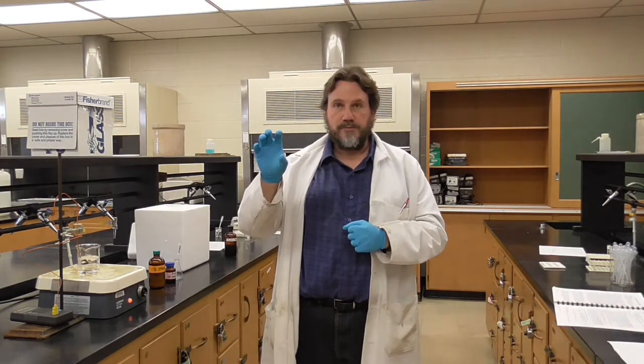The reaction that we're looking at is always the same in this lab. We're taking starch and we're breaking it down. All right, so the hydrolysis, the breakdown of starch. Of course, starch you can find in potatoes. It's a very long, large, complex carbohydrate.